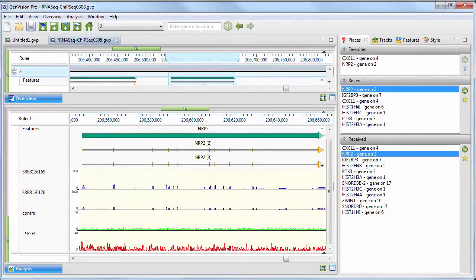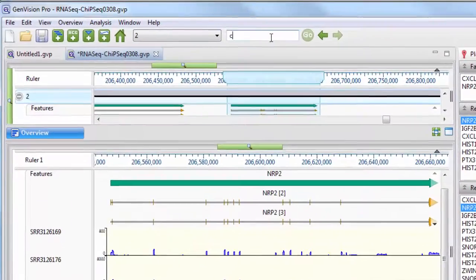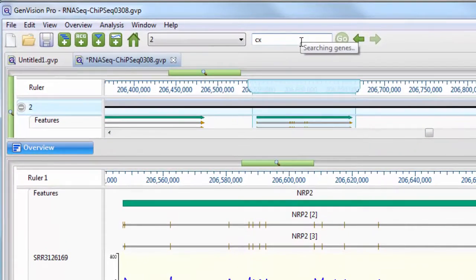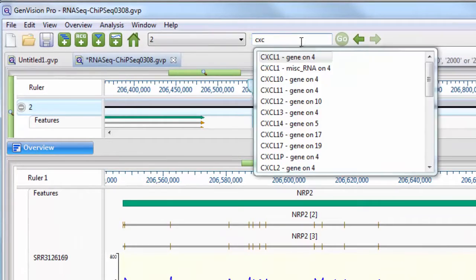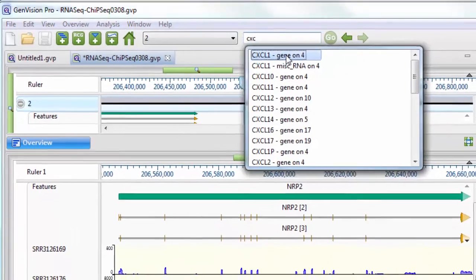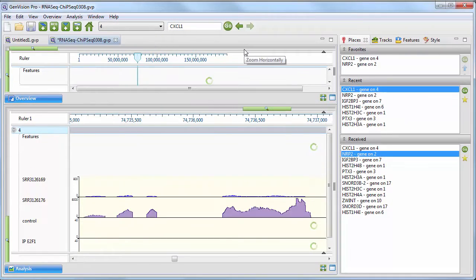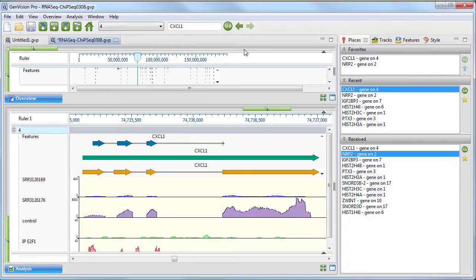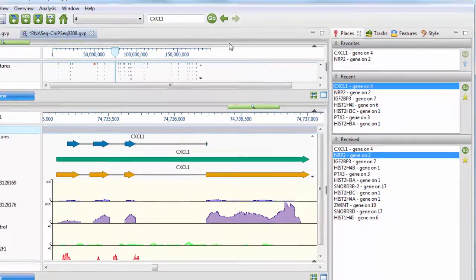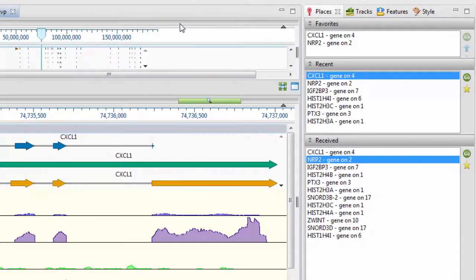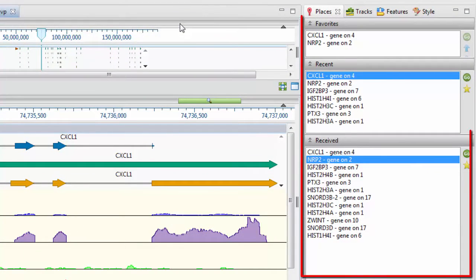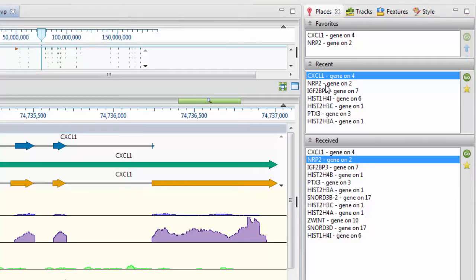Search for areas of interest by any combination of criteria, including gene name, chromosome number, and sequence position. GenVision Pro will keep track of your browsing history so that you can easily navigate back to regions of interest.